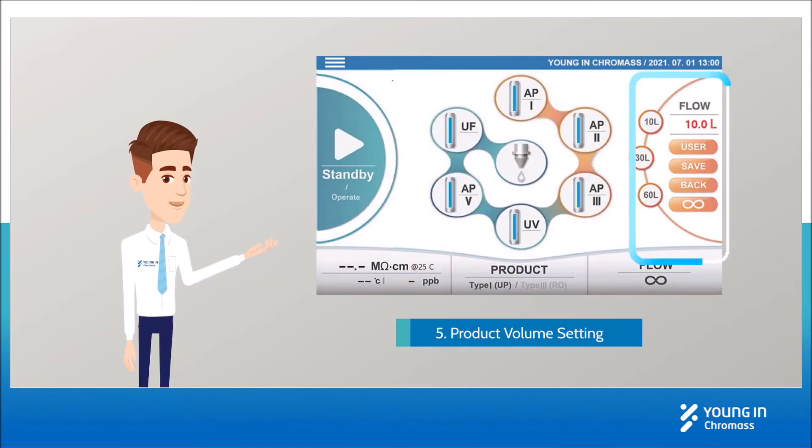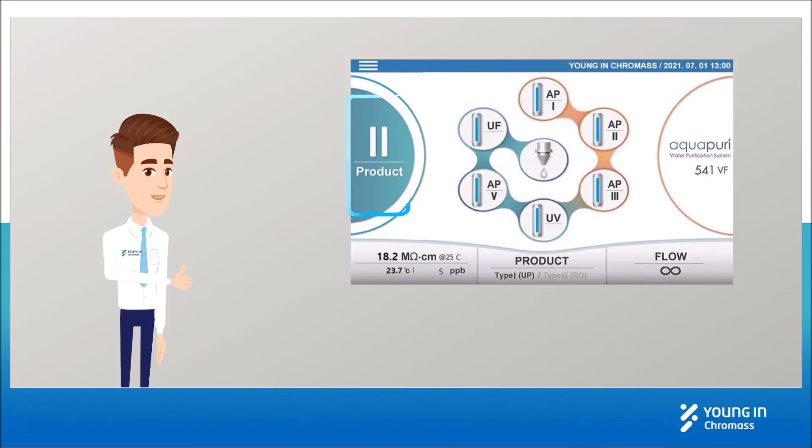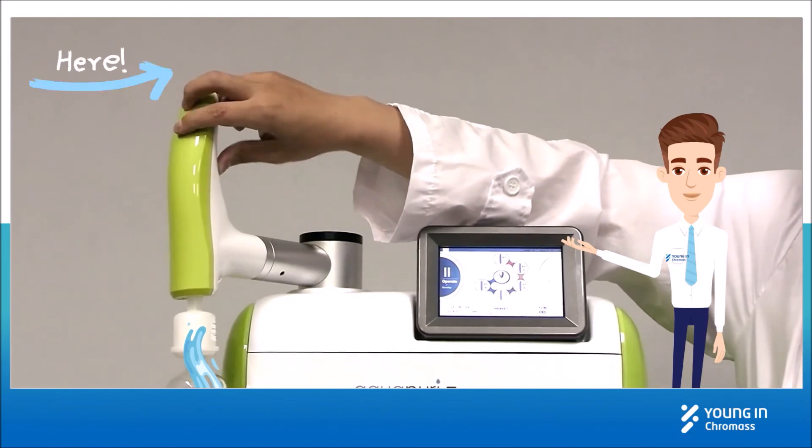Set the product volume. When the status turns to product, you can produce water by clicking the button on the dispenser.